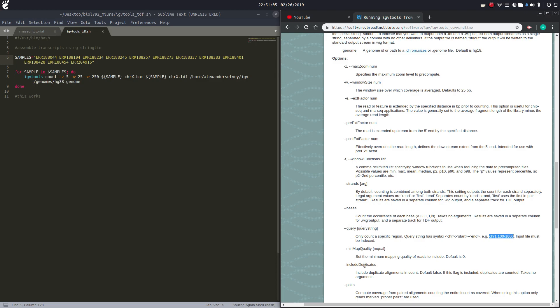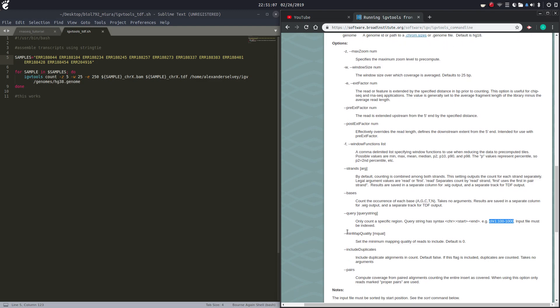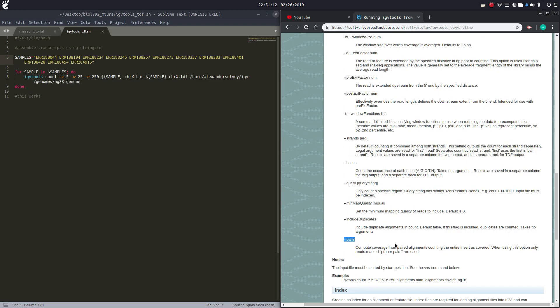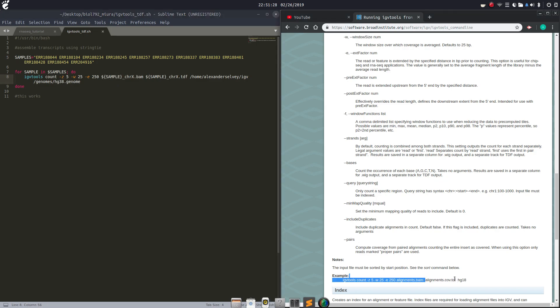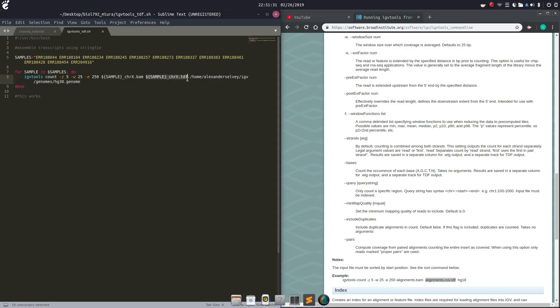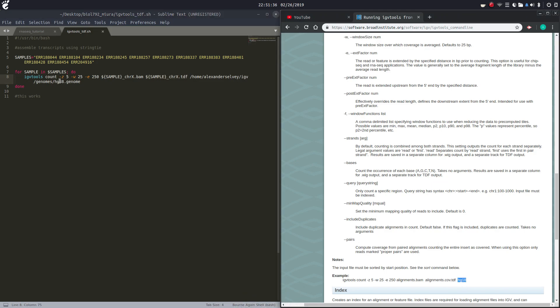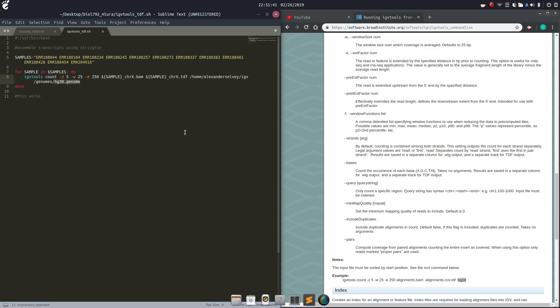Other options include minimum map quality, includes duplicates, and pairs. The example given in the documentation is where I got my -z, -w, and -e values. Our alignments are the sample chromosome X BAM file, here are our TDF output files, and for the genome I gave the full path to the hg38.genome file since just typing hg18 didn't work because I wasn't in the correct folder.